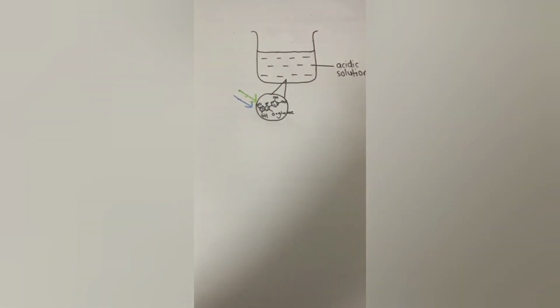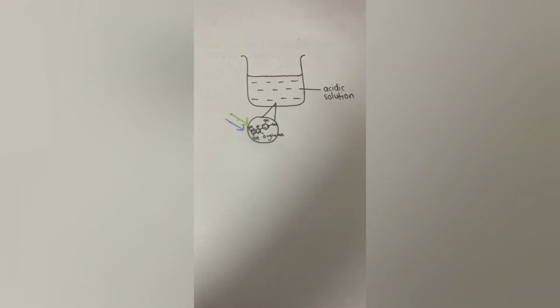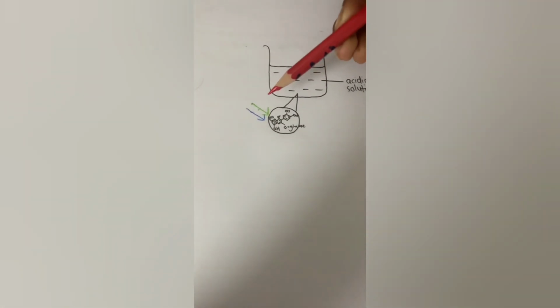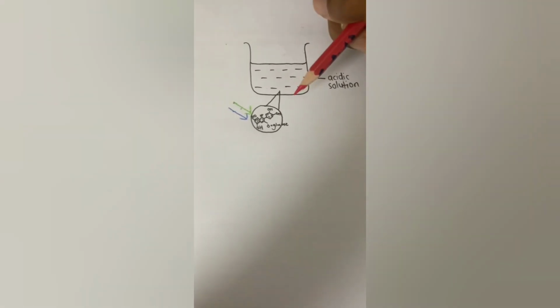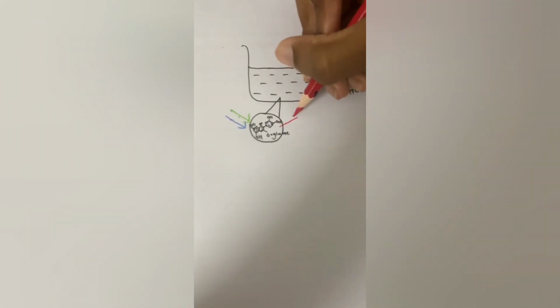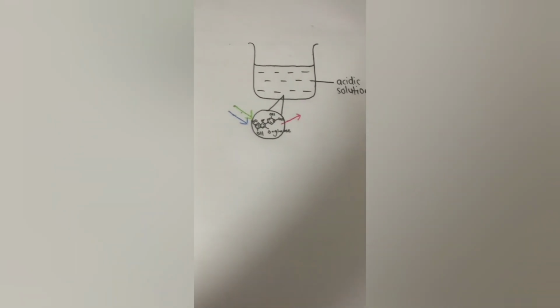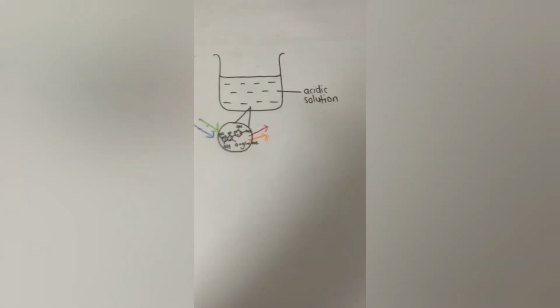hits the anthocyanin group, and basically what that does is during conjugation you have to note that when the light is absorbed, its complementary color is released. So green light is absorbed and red light will be released, which is what we see in our naked human eye. And as you can see here, blue, it's somewhat orange, so that's what happens.